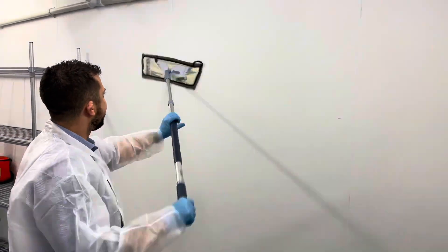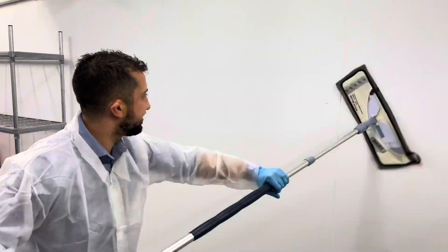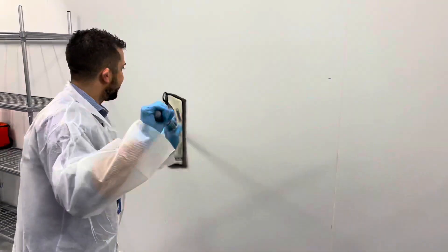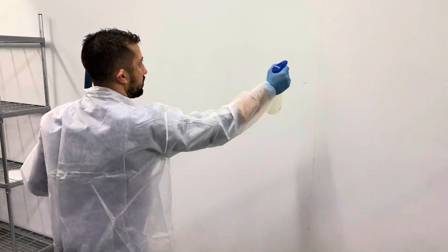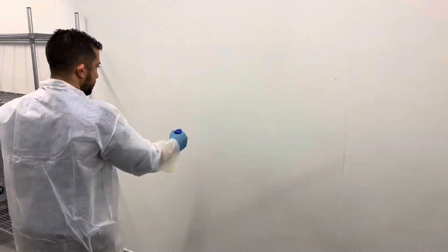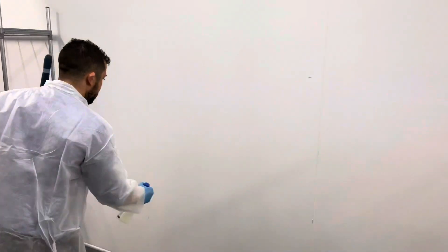Now use the micro clean mop impregnated with a detergent to clean the walls, again using a horizontal motion from side to side. Or you can spray the micro clean detergent directly onto the walls before wiping it.